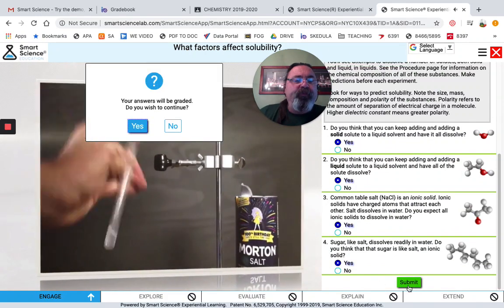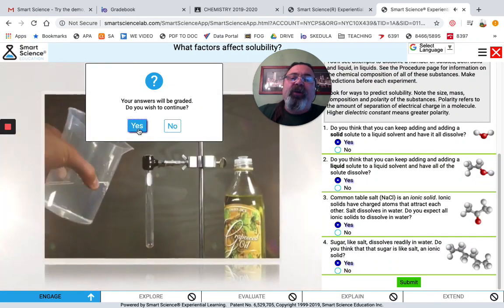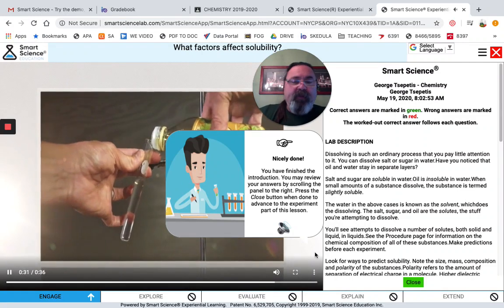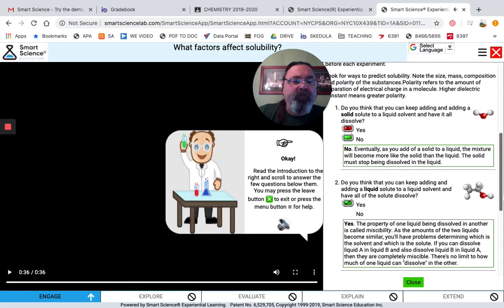Submit. It gives them the box: do you really want to do this? They say yes. Are you sure? Yeah, I'm good. Yes. Okay, nicely done. Boom. You have finished the introduction. You may review your answers by scrolling the panel to the right. Press the close button when done to advance to the experiment part of this lesson.